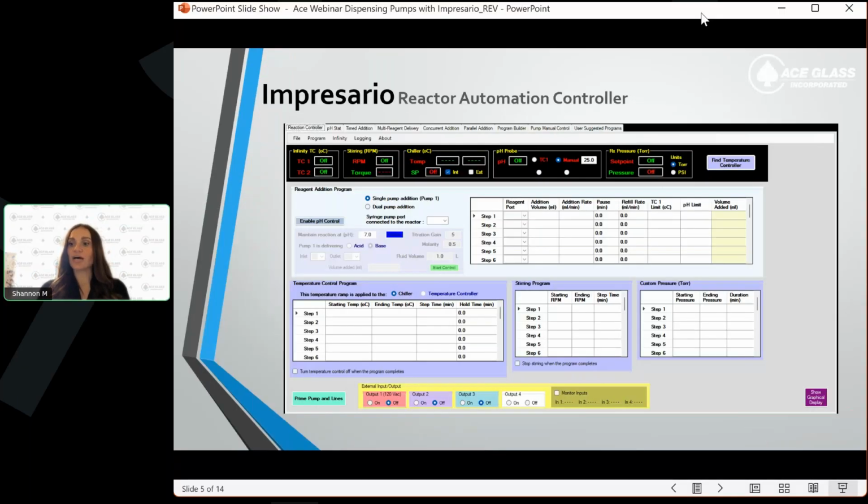This is a screenshot of what the software will look like on your computer. You can see at the top across the display deck in black that there are 5 peripherals in this demonstration that are being controlled and monitored. Below the display deck is a more in-depth view of each peripheral, which also includes potential reaction steps of each as well.